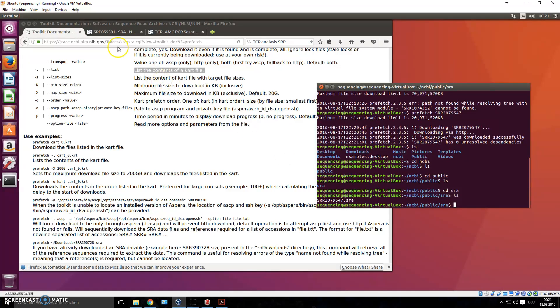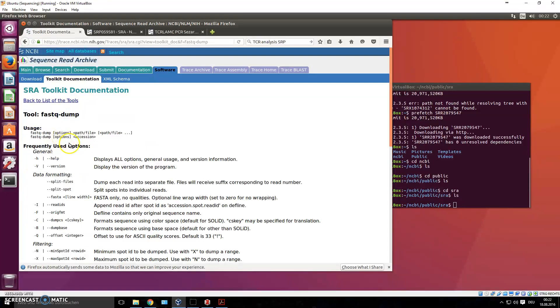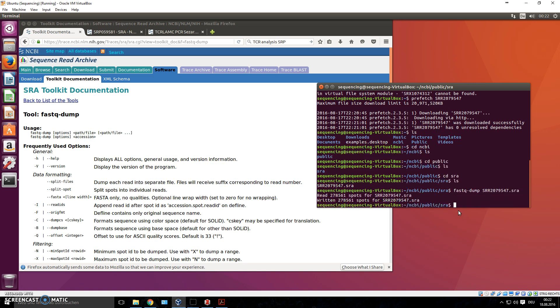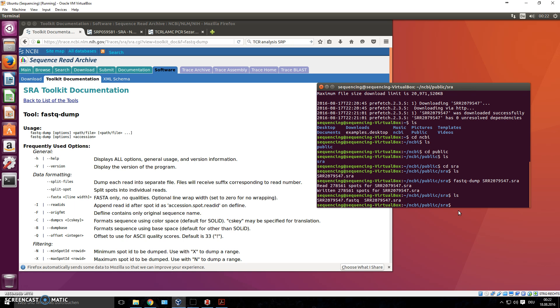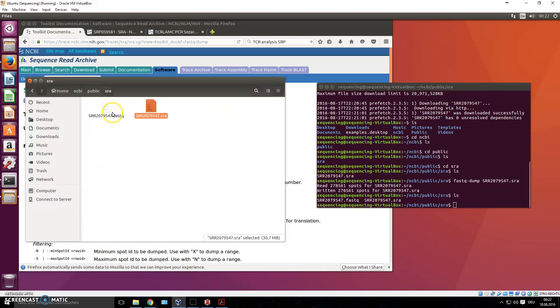We can't use an SRA file directly — we want a FASTQ file. The toolkit has `fastq-dump`, which converts SRA data into FASTQ format. We're now in the folder with the SRA file, so we type `fastq-dump`, press Tab to auto-complete, then type the SRR file number and press Enter. It converts the file and when done, running `ls` shows we now have a FASTQ file. We have both the SRA file and the new FASTQ file in this `ncbi/public/sra` folder.